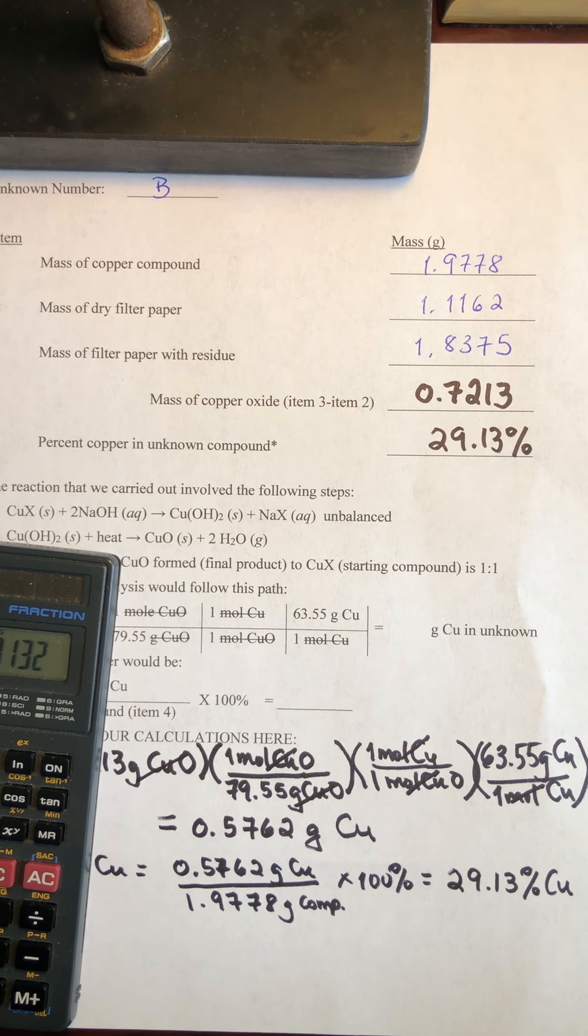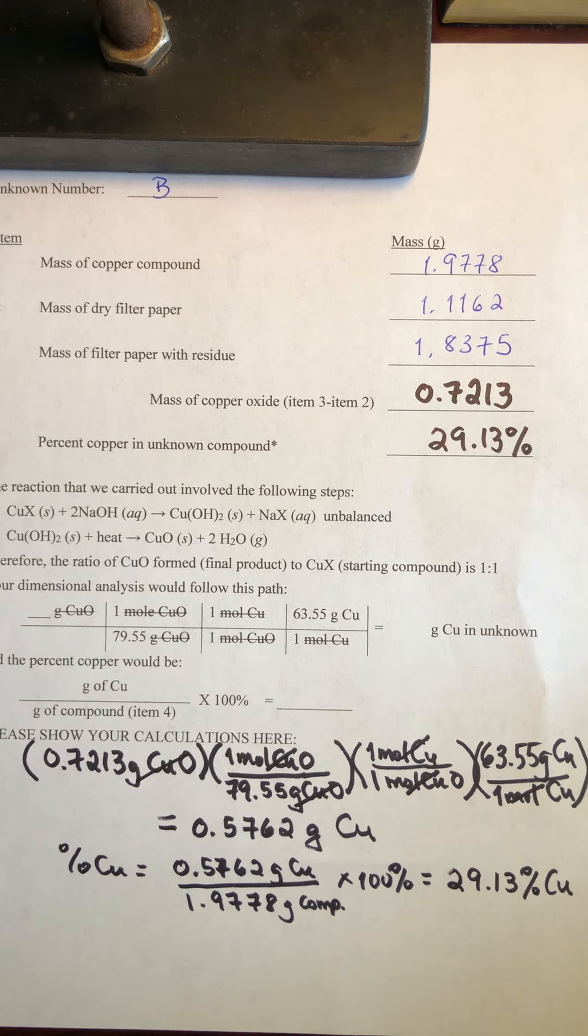So the next step is going to have to be, let's see what were the candidates that we were given. In other words, what were the possible identities of our compound? And let's see which of those would match the percent copper that we found in this experiment.